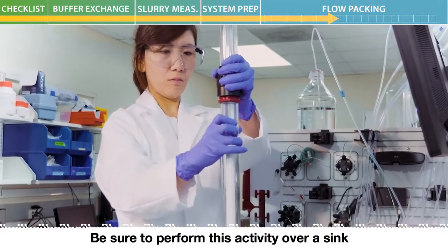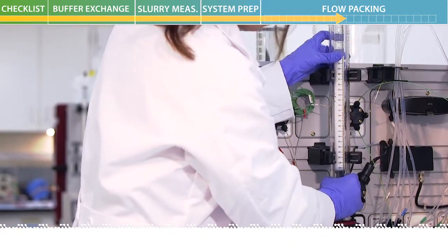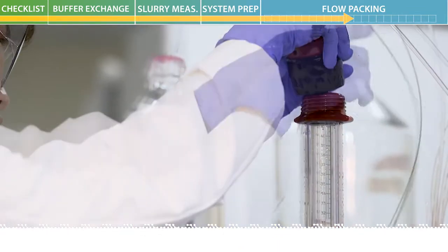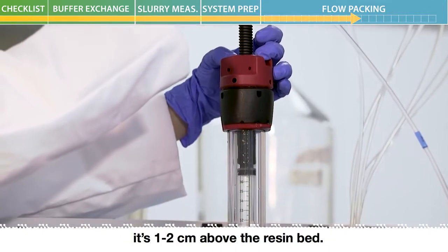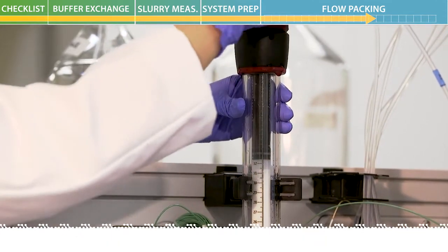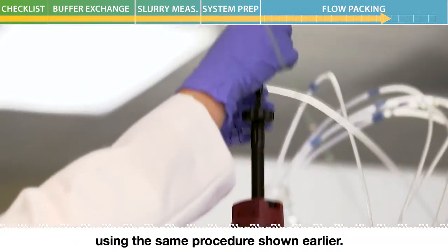Be sure to perform this activity over a sink or an area that can catch the residual buffer. Mount the column back to the column holder of the ACTA system. Attach the top adapter again using the same procedures you did earlier. Slowly lower the top adapter until it's 1 to 2 centimeters above the resin bed. Tighten the O-ring, then lower the top adapter by slowly turning the end cap. Be sure to stop right when the adapter meets the top of the resin bed. Once again, connect the column to the system using the same procedure shown earlier.